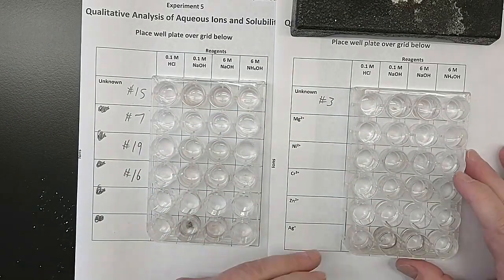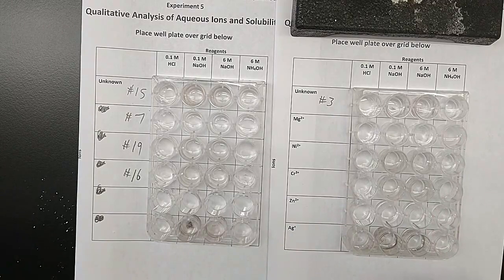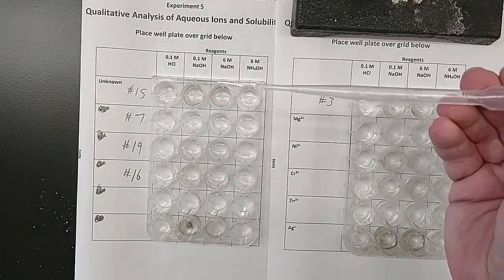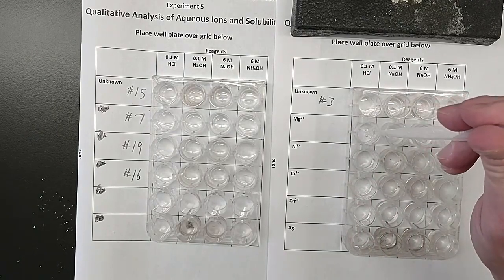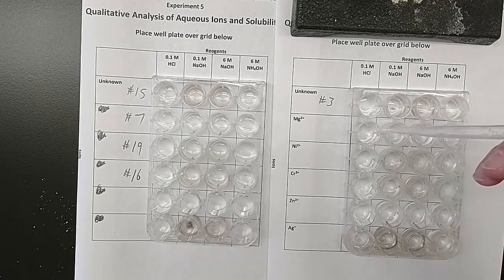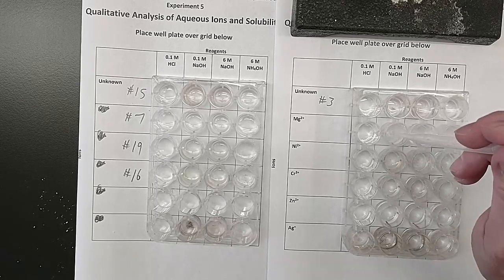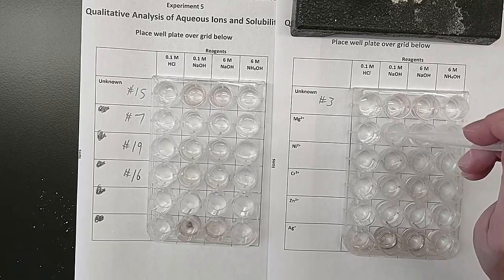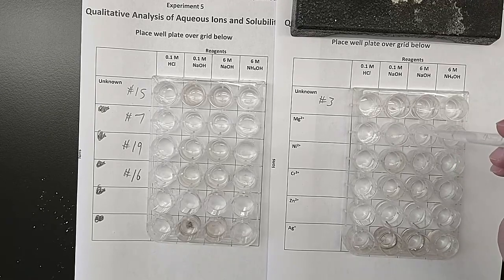Now, you can't really tell what's going on because we haven't stirred these, and we need to stir a solution to make sure that it's a solution. So I'm just going to use a pipette, and I'm going to squeeze it, and that'll stir it. Okay, so I'm just squeezing it in and out, making sure that it all goes out before I move on to the next one. I really should use a clean pipette or a stirring rod or something for each one, but this is a nice and fast way, and I can get it all out just by squeezing it out. Right? So in and out, stirring this one, get it all out. The next one. Try to get it all out, and to the next one.